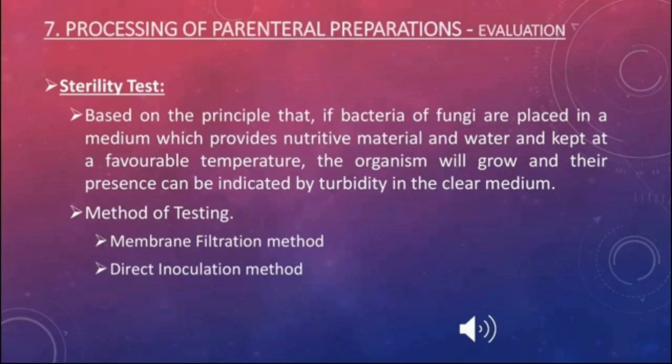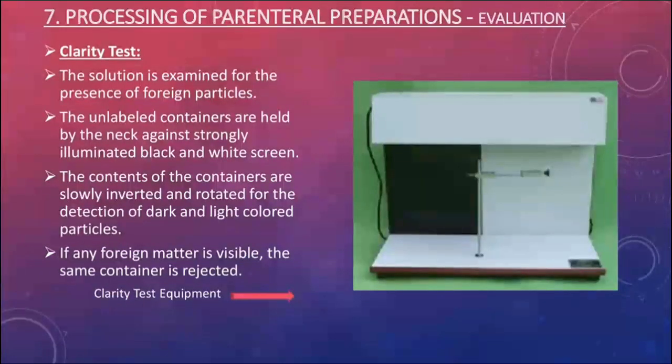If they are readily distinguishable from those growing in the containers reserved in the first test, a second retest is performed using twice the number of samples. The preparation being examined passes the test for sterility in case there is no evidence of microbial growth. In case there is evidence of growth in the second retest, the preparation being examined fails the test for sterility.